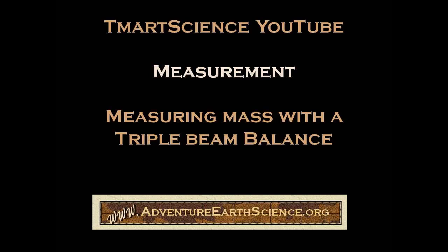In this screencast, I want to show you how to measure mass using a triple beam balance.